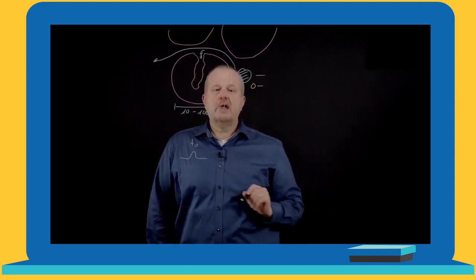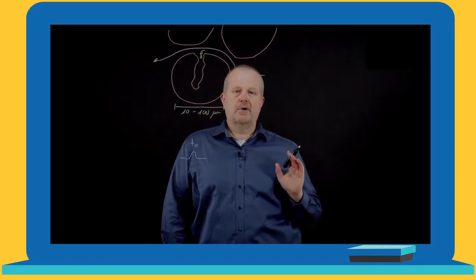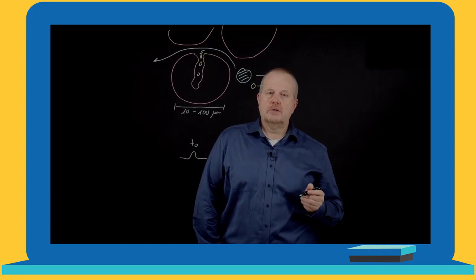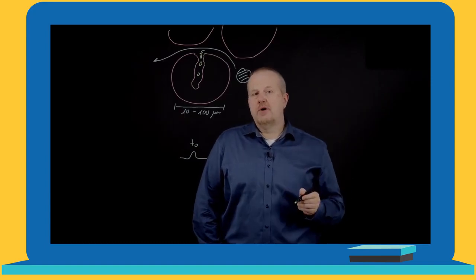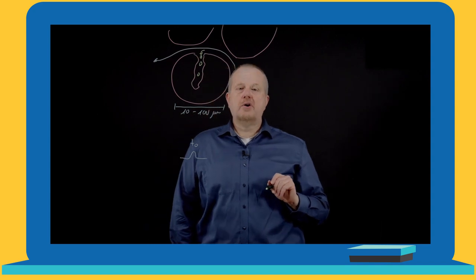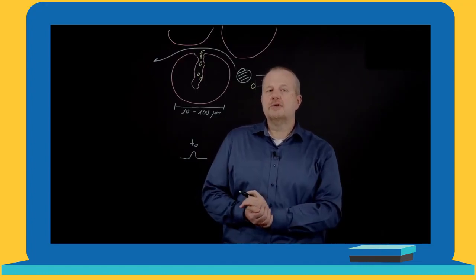Up to this point, we have convection. So the faster our pump is pushing the mobile phase through our column, the faster our compounds travel. As soon as the compound enters the pore system, it is transported solely by diffusion. And diffusion is much slower compared to convection. So it takes a relatively long time for our compound to travel along the pore system.